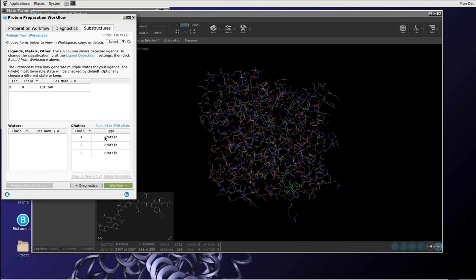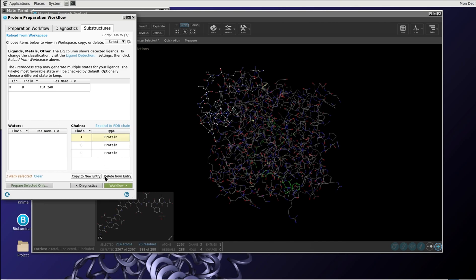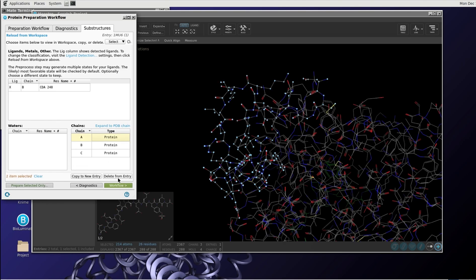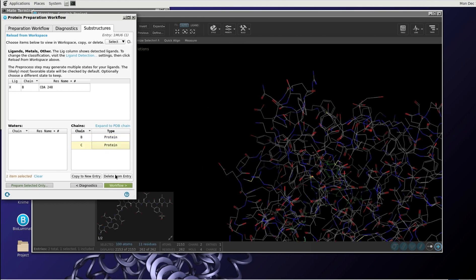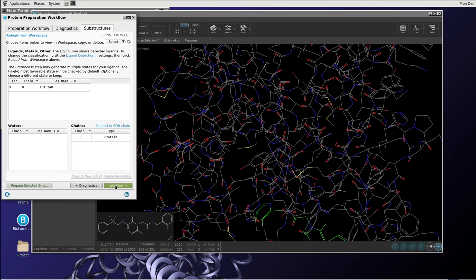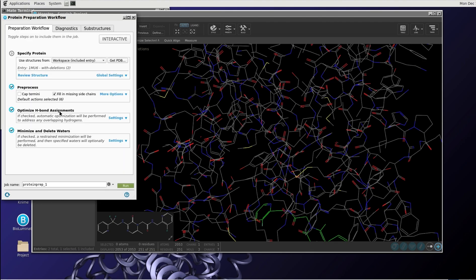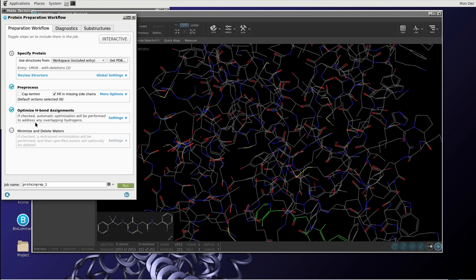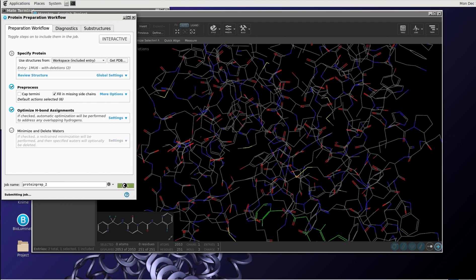Then we know that you can also delete chain A and chain C as follows, just to make everything a little bit faster. We uncheck this minimization button. And then I think we can optimize hydrogen bond assignments. That's important because then the hydrogens are added to the protein, which is required for the docking itself. So we can now type run.